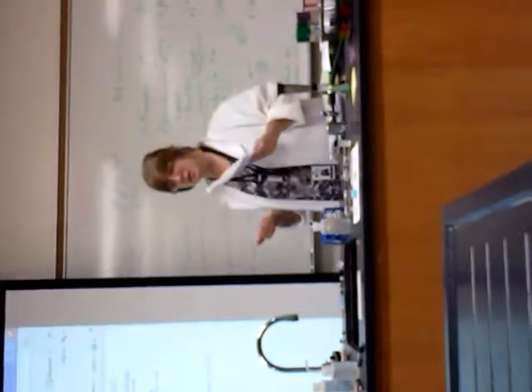When we start talking about vectors today, and I'm talking about mites or lice, they're not going to be under oil immersion. In fact, they're going to be under the lowest power. Same thing for worm eggs and protozoans. They're not going to be under the highest power. If I have a mycobacterium under there, it's probably going to be under oil immersion.